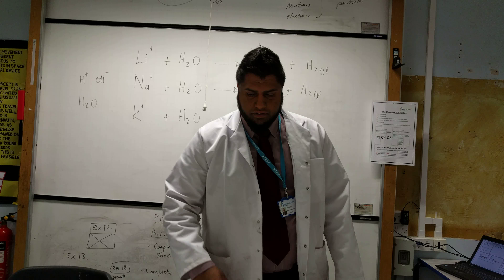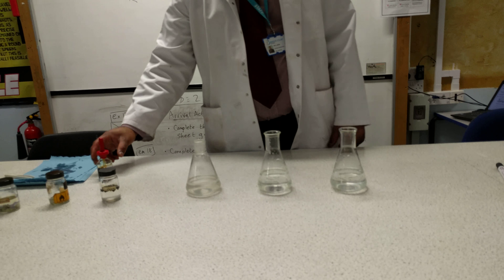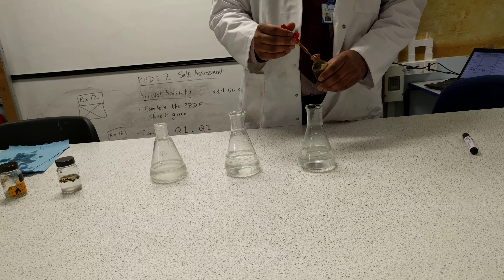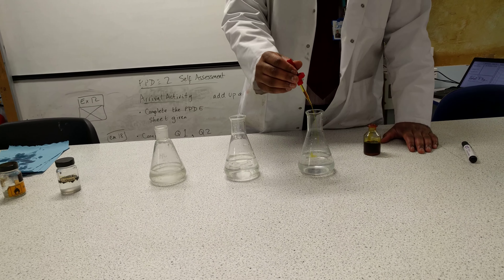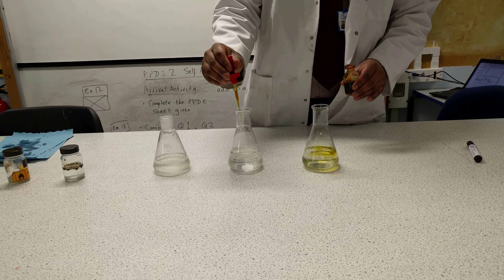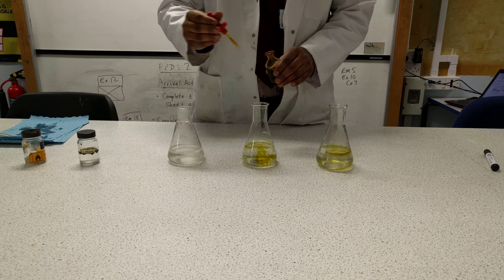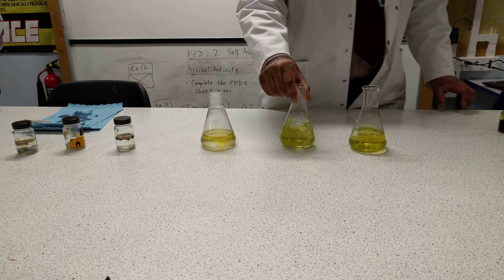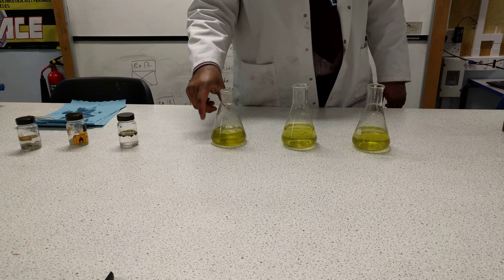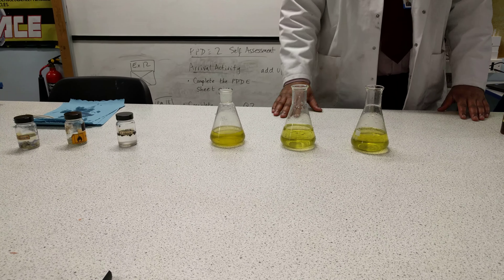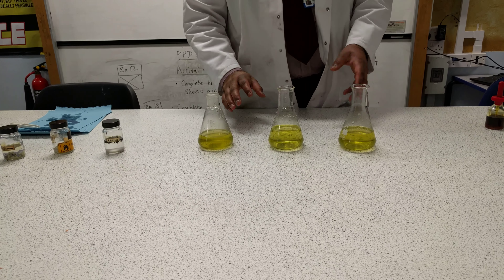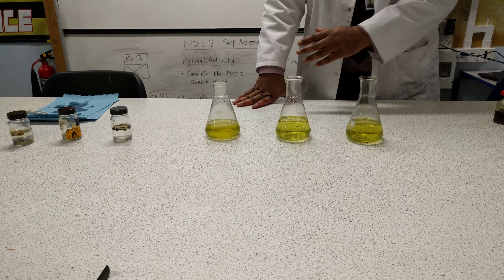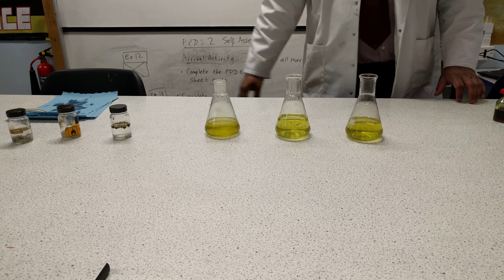I've taken some conical flasks and I'm going to add some water to each of them. To check the pH and find out whether it's acidic or alkali, we put in a universal indicator. We can clearly see that the water turns green in color, which indicates a neutral pH. There may be a slight tinge of yellow because water is not absolutely neutral — it depends on how the water is treated — but at the moment it's greenish, so we take it as neutral.